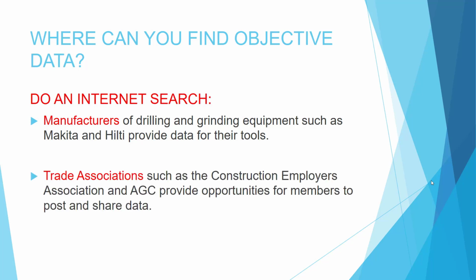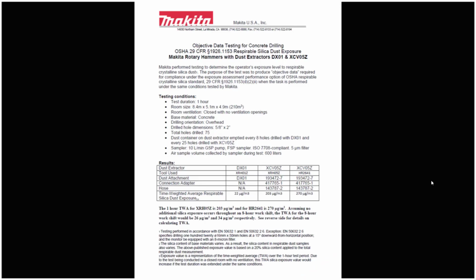Trade associations also provide opportunities for members to post and share data. Here, you can see an example of objective data available online that is supplied by Makita for their rotary hammers with dust extractors for concrete drilling.